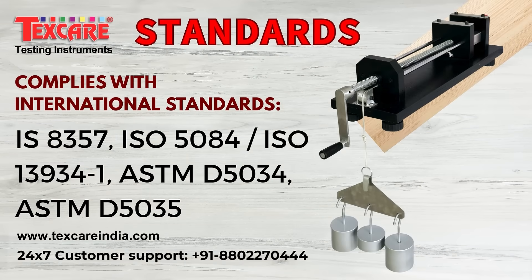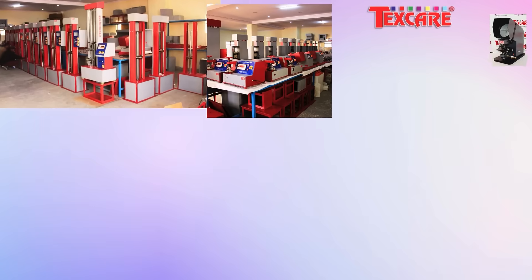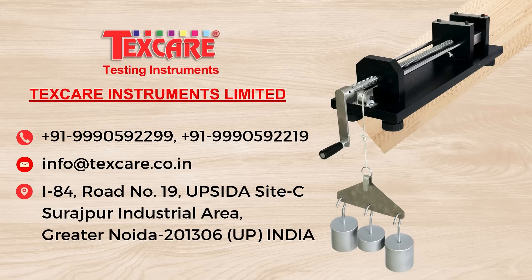Complies with international standards. Contact Texcare today to learn more about the Fabric Extensometer.